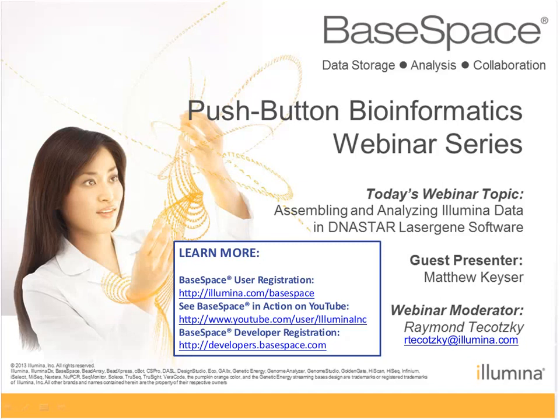Great. There's another question about sharing. How can they share their data or their results or the application with others? So we have a number of options for licensing. Our desktop software provides networked licensing, and networked licensing allows licenses to float between computers.